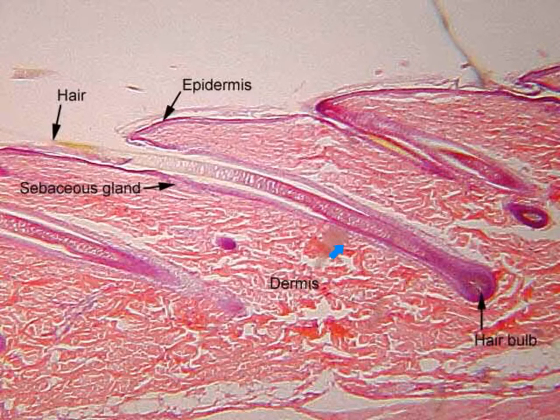We have a little sebaceous gland coming off, an oil gland. Here's another little oil gland. So we can see those structures. What we do not see would be away from this area. We would see the sudoriferous glands, or the sweat glands, and those are not visible on this particular slide, but do be aware of those for the lab practical purposes.